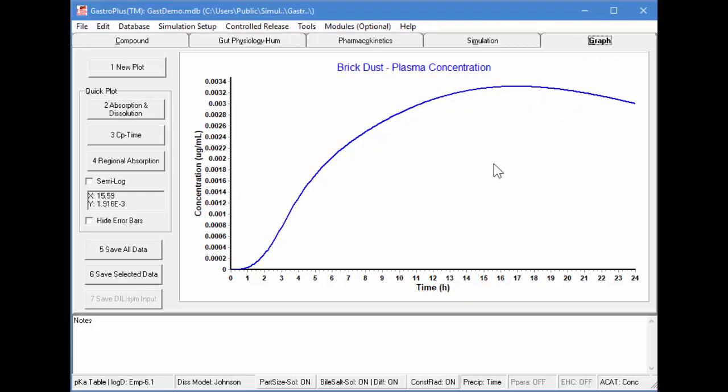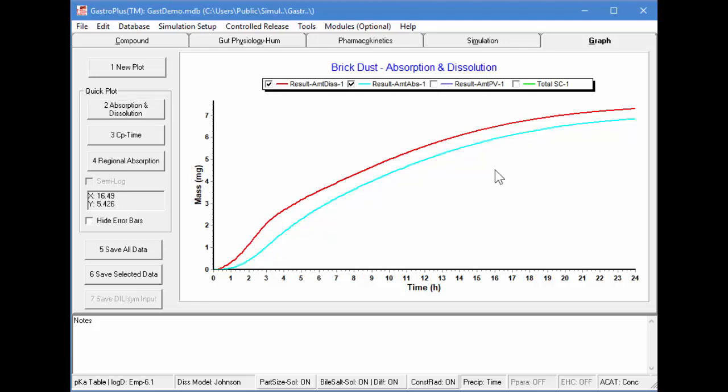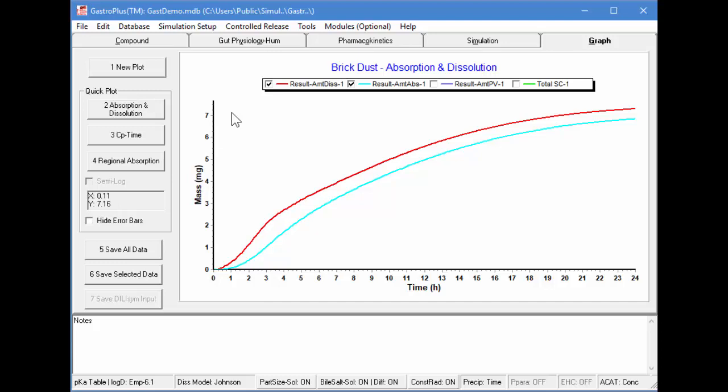I'll go into the graph tab and plot absorption versus distribution. We only want to look at the amount dissolved and the amount absorbed. So I'll turn off these other two graphs. And as you can see, the graphs correspond with each other, which says that this is probably solubility limited. You'll also notice that after 24 hours, only a total of 7 milligrams have been dissolved. So the other 3 milligrams are still undissolved.